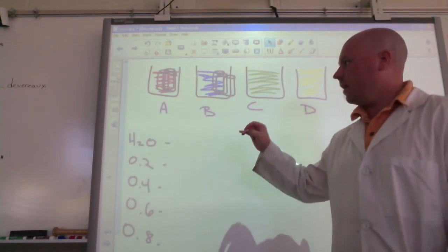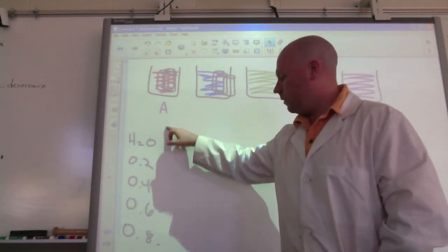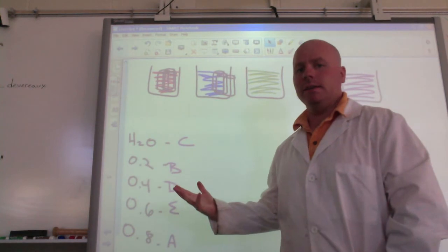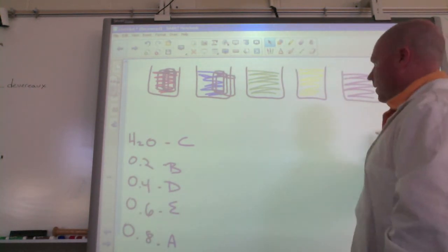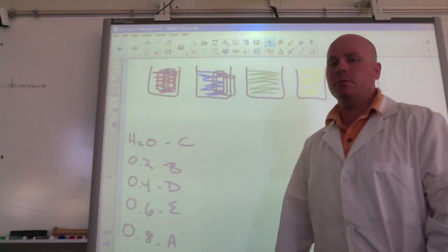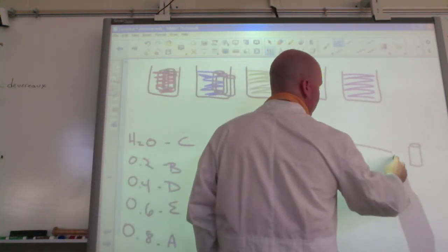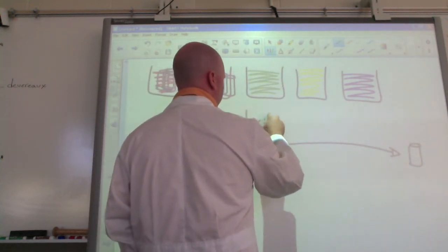But you're going to have to figure out, is water, I think water is C, B, I think A is 0.8, D is 0.4, E is 0.6. All right, I'm just making these up. I don't know what I'm going to do yet. I haven't made the solutions yet. But I need you to figure out which one is which based on the rate of osmosis in these potatoes. Okay? And I will give you bonus points if you could figure out a way to tell me the molarity of the potatoes.